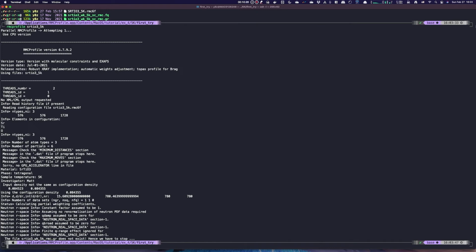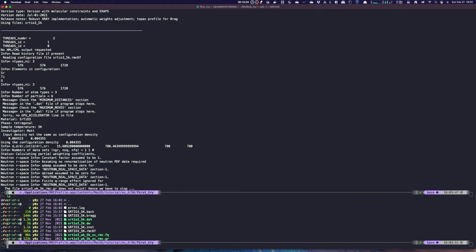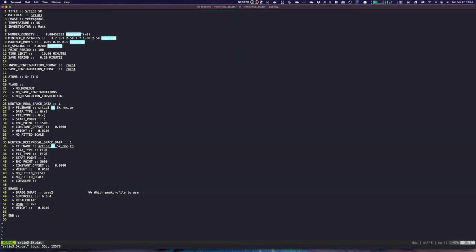If you remember, I just mentioned that in the first trial given by the tutorial, it is trying to use the data which is not on an absolute scale. So the file name here is somehow wrong, so we have to add in the _sc representing scaling.